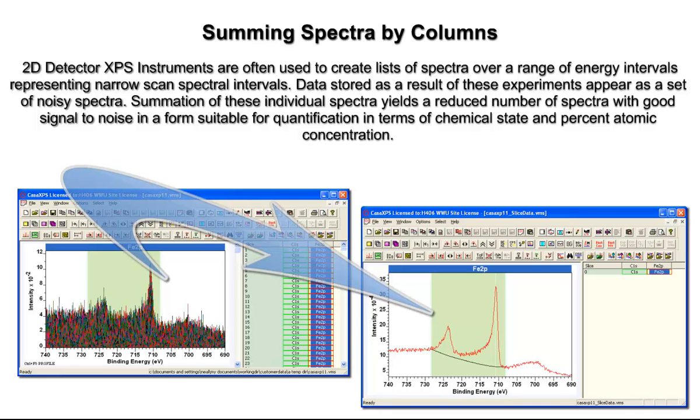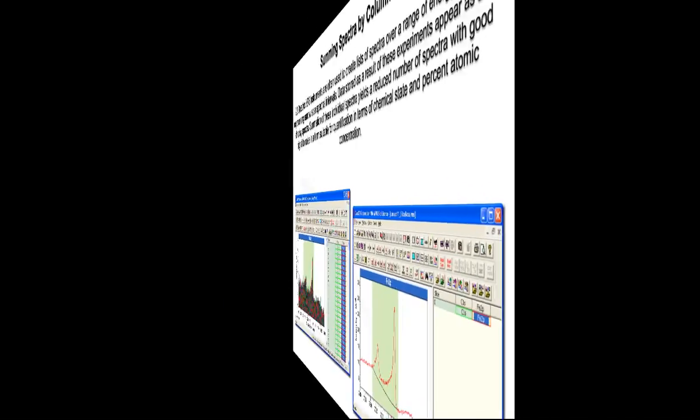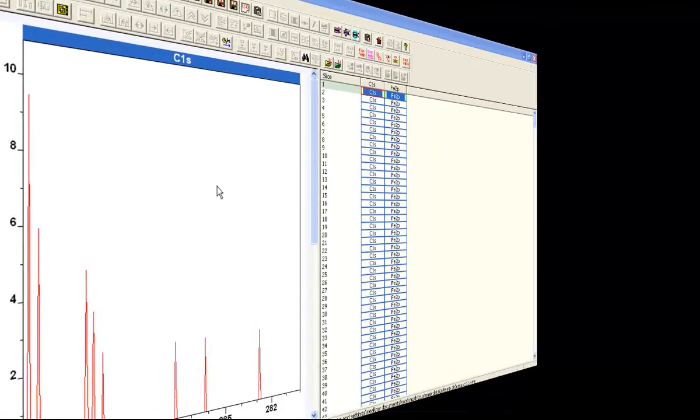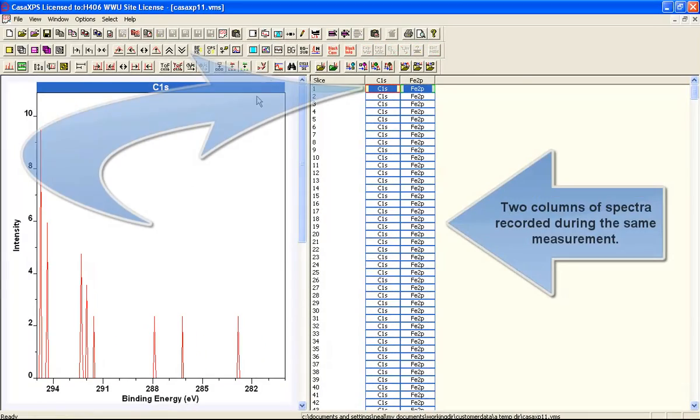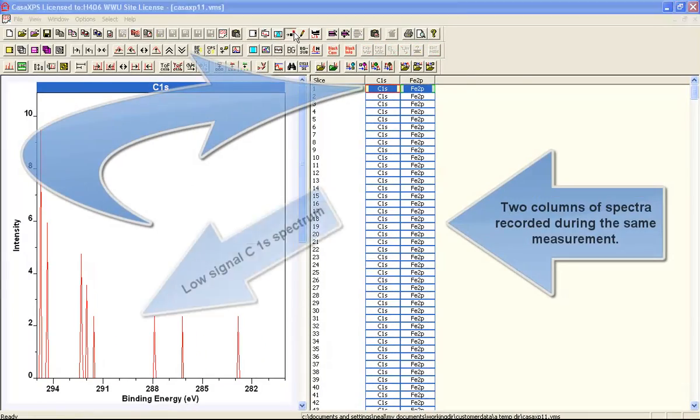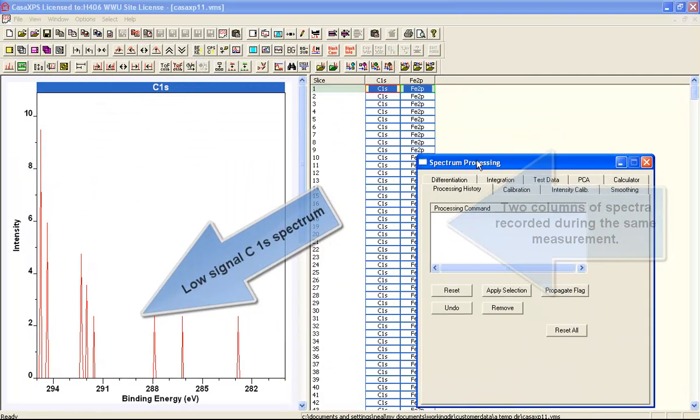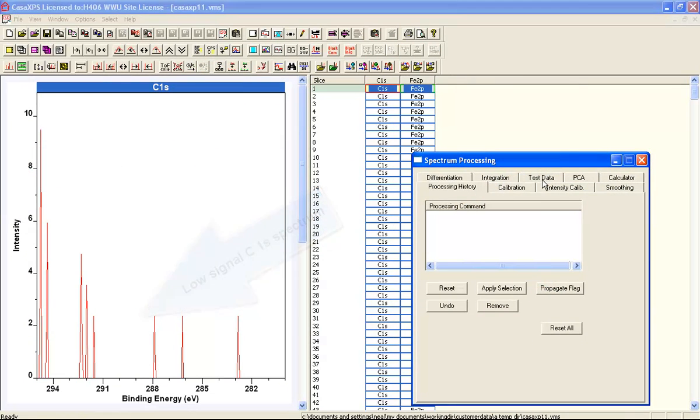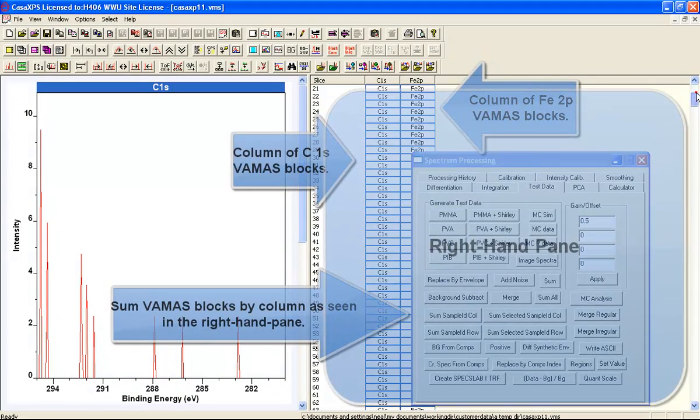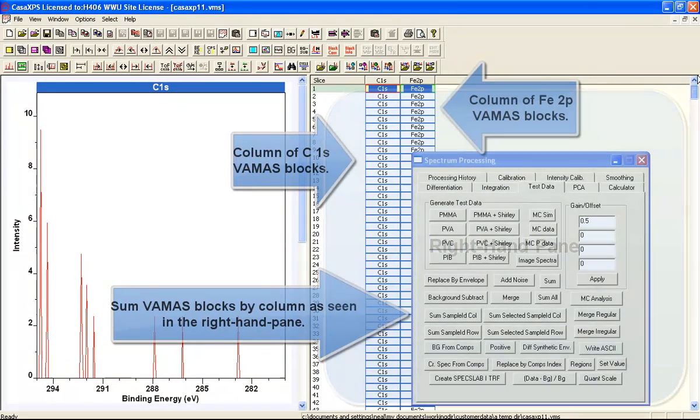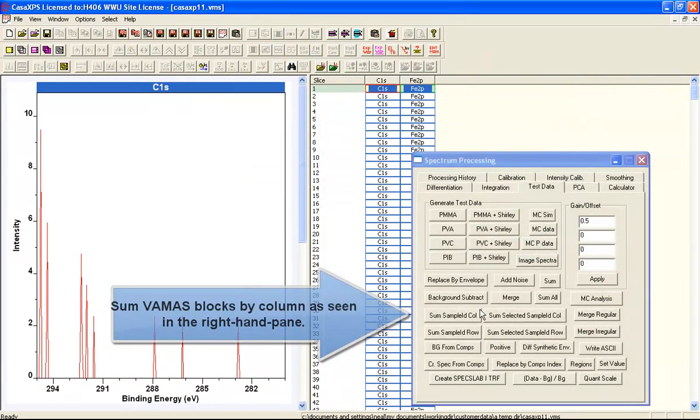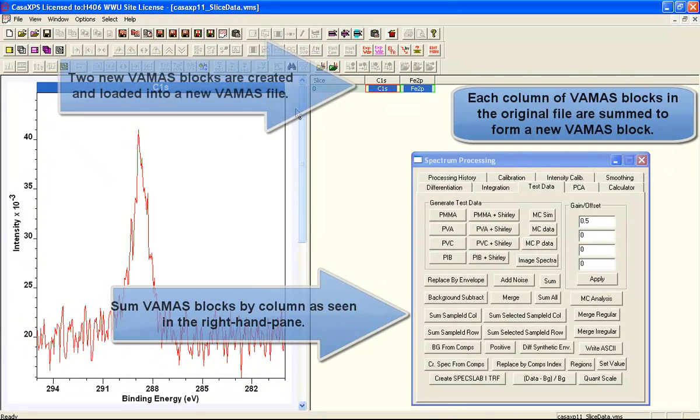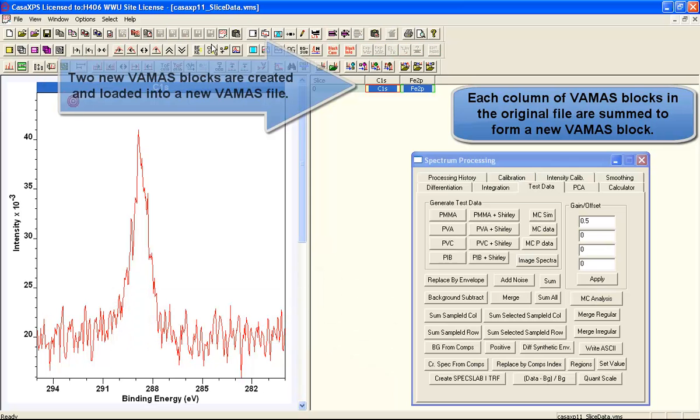Data required in parallel can be saved in a VAMAS file as a sequence of VAMAS blocks. In this example we have carbon 1s and iron 2p spectra which have been measured using a 2D detector, and so we end up with a set of detector slices all saved as individual VAMAS blocks.